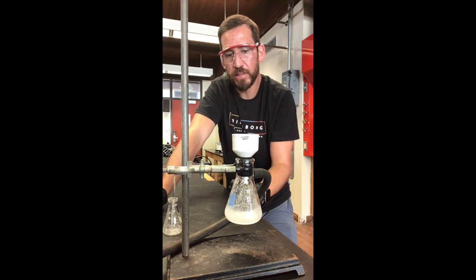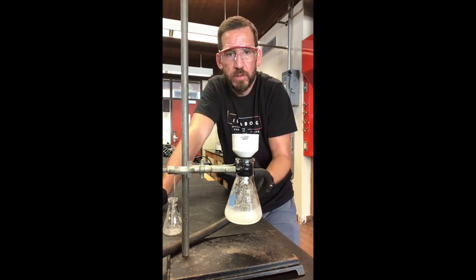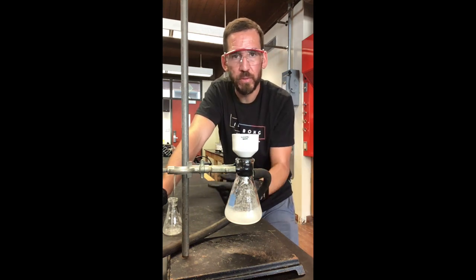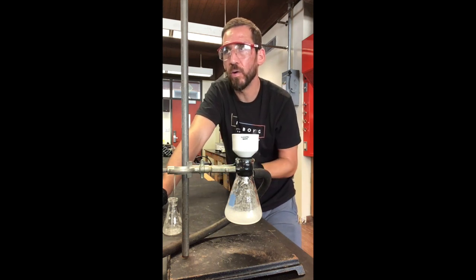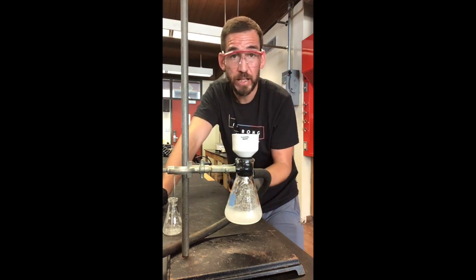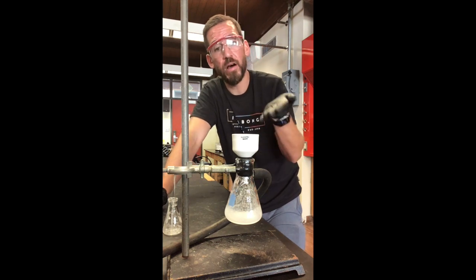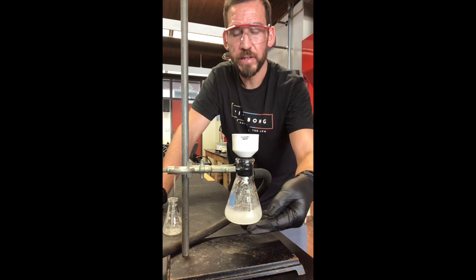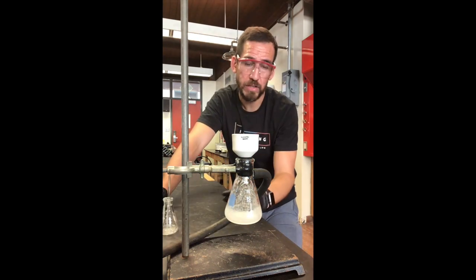And so this will give us an explanation as to why certain procedures or chemical reactions aren't going to yield 100%. So one of the things obviously would be that maybe the reaction didn't go to completion, or in the case of caffeine, we might extract it from tea or coffee, but maybe our extraction procedure wasn't very good. And then also when we finally purified it, we obviously have some white material down here, we left some here, and so we lost product like that.